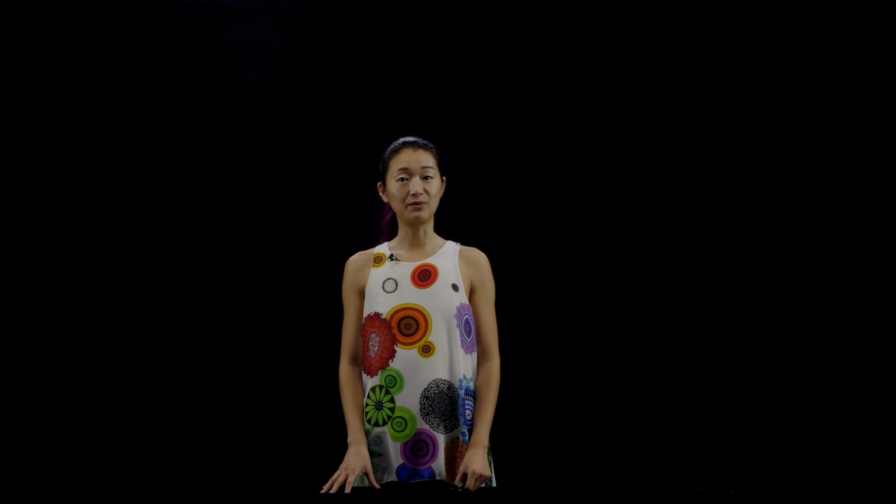Okay, so that is all the things that we can do in terms of optical recordings of neural activity. Just like we talked about with electrical recordings, there is a set of techniques for recording activity. And then kind of on the flip side of that coin is that we also want to be able to manipulate the activity. Now, there's a couple of different reasons we want to do that, and one of them is that being able to manipulate neural activity directly gives us a lot more control experimentally and gives us the ability to ask questions that are not possible to do with passive observation alone.